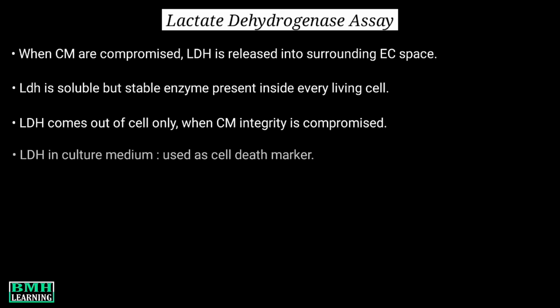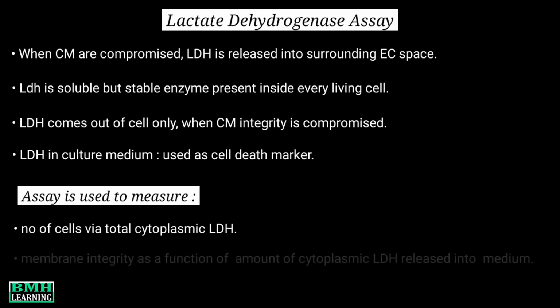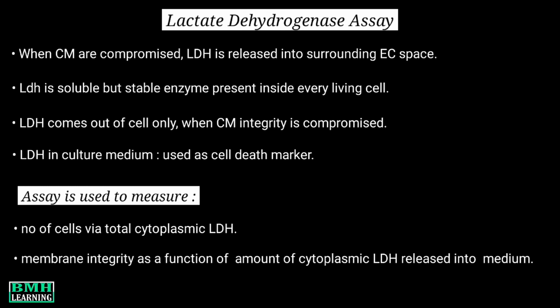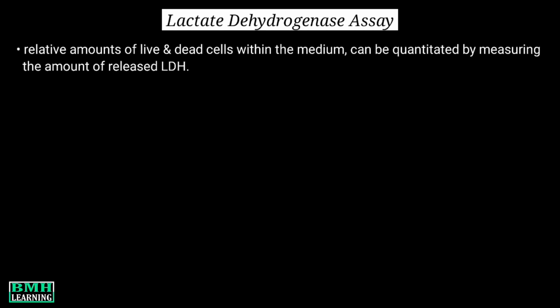So this means the presence of this enzyme in the culture medium can be used as a cell death marker. So lactate dehydrogenase assay is used to measure either the number of cells via total cytoplasmic lactate dehydrogenase, or membrane integrity as a function of the amount of cytoplasmic LDH released into the medium. This way, the relative amounts of the live and dead cells within the medium can be quantitated by measuring the amount of released LDH.